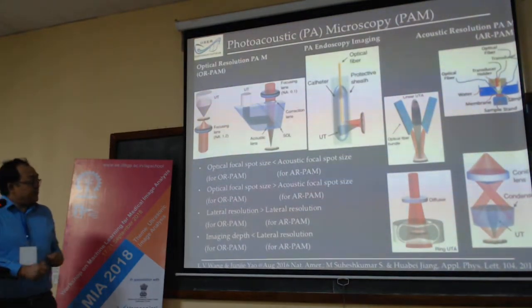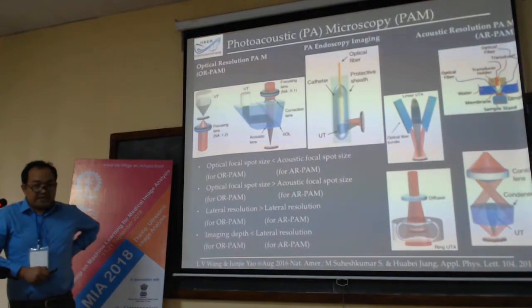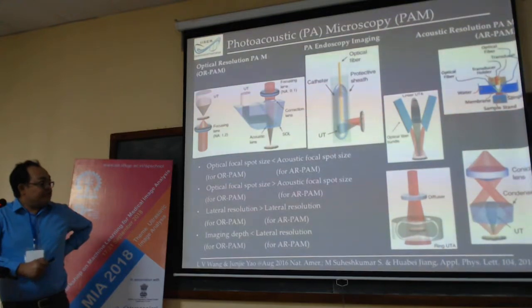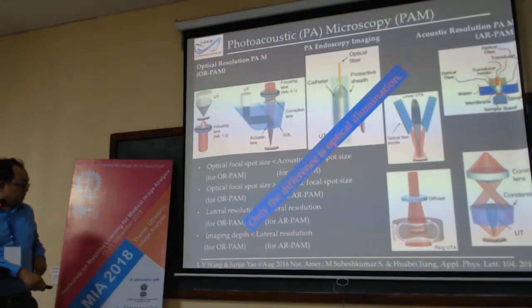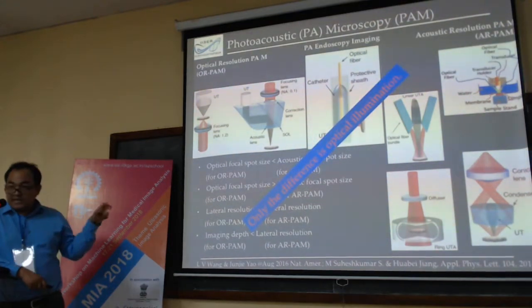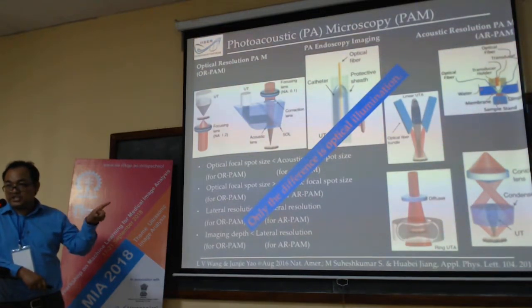Very recently, people have also exploited photoacoustics for endoscopy applications. People used to divide it into 3 parts. Here the difference is in the optical illumination; detection is the same, reconstruction is the same.